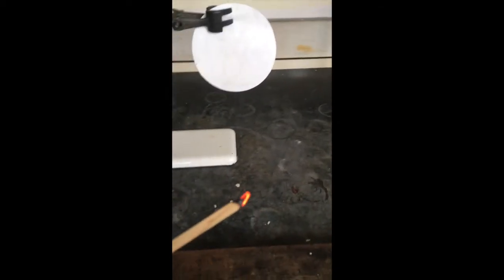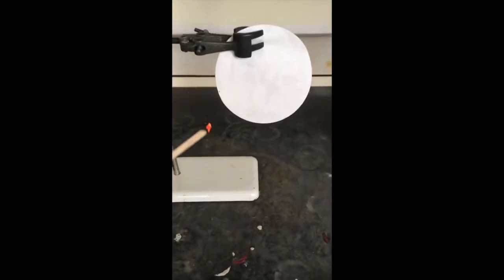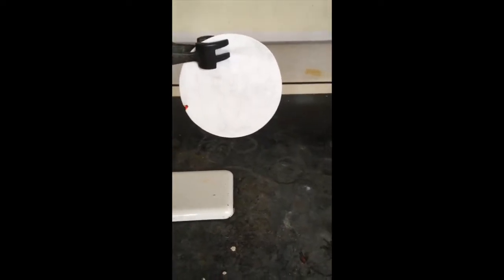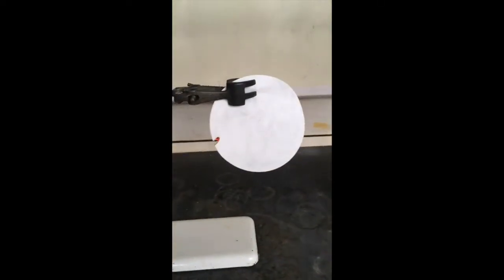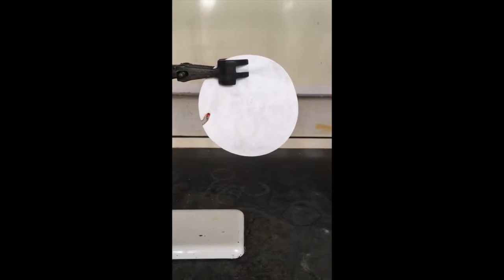Now take a lighted splint and blow it out so that it is glowing, and touch it to the edge of the filter paper and watch your word appear in fire.